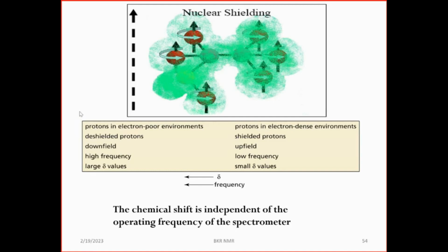Okay. So if I take an example of ethanol, how many H signals do I get here? How many hydrogen signals in proton NMR? 3, ma'am. 3. So now the hydrogens are different because they have different chemical environments.